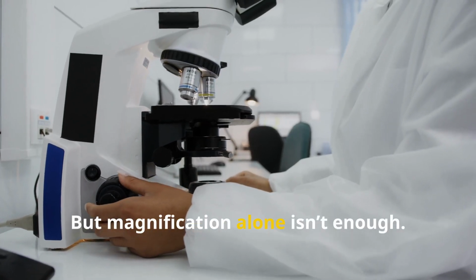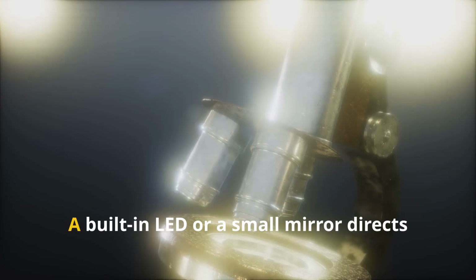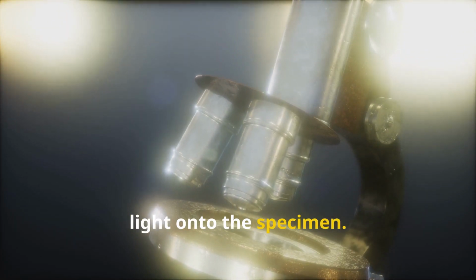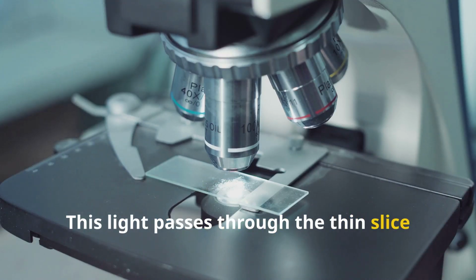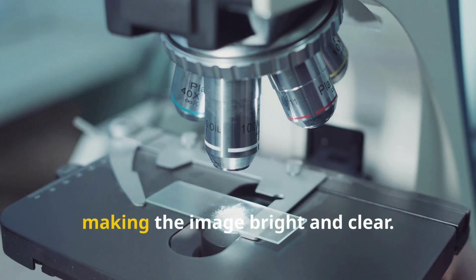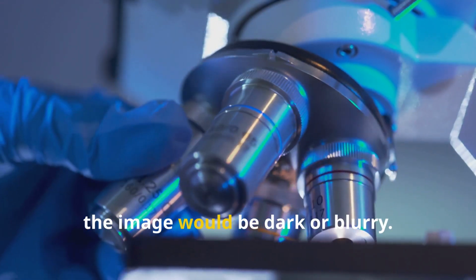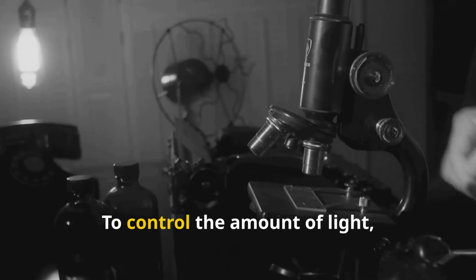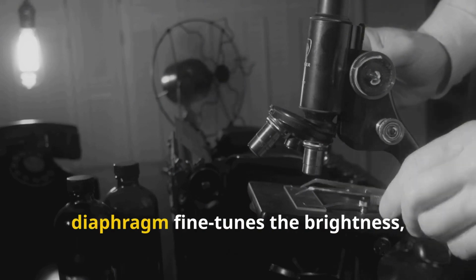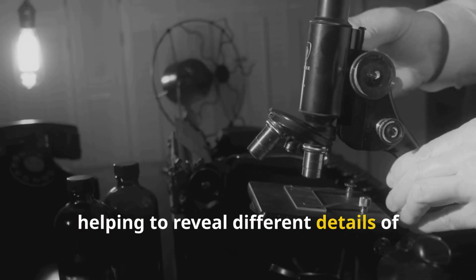But magnification alone isn't enough. Light is just as important. A built-in LED or a small mirror directs light onto the specimen. This light passes through the thin slice of material on the slide and enters the objective lens, making the image bright and clear. Without proper lighting, the image would be dark or blurry. To control the amount of light, a small adjustable part called the diaphragm fine-tunes the brightness, helping to reveal different details of the specimen.